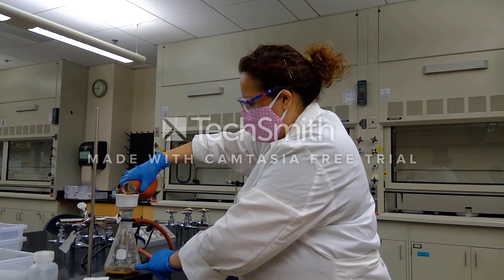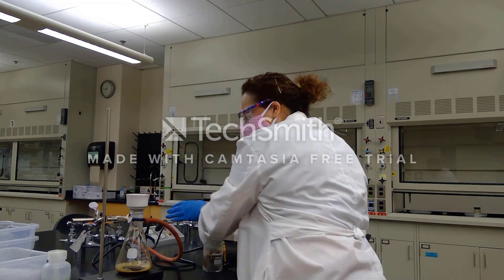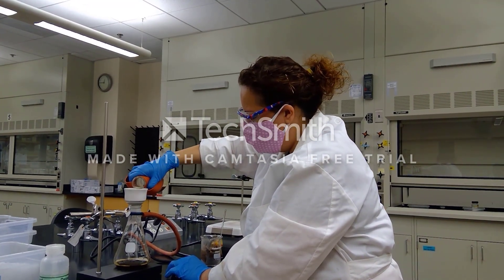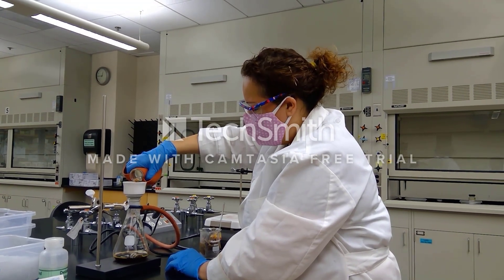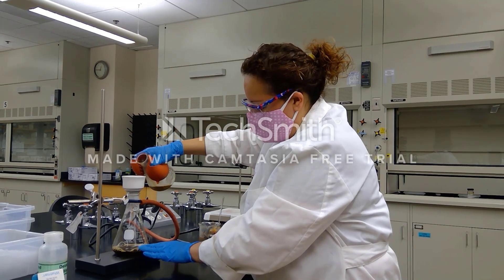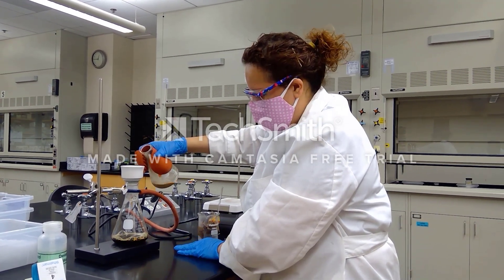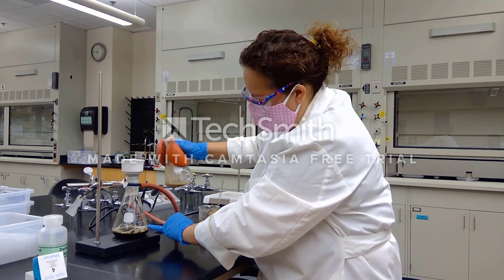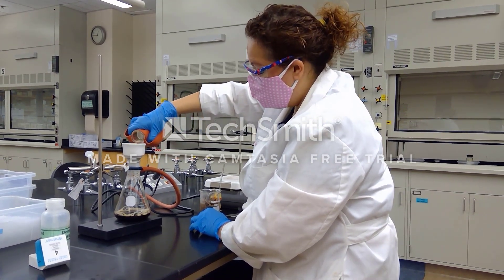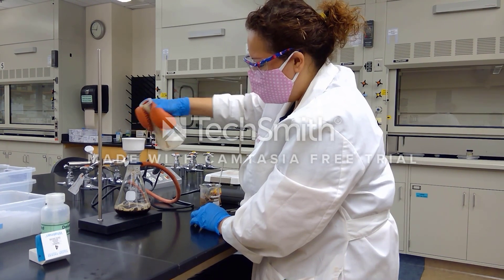As I'm filtering I'm checking my filtrate down below to ensure that we have a nice dark coloration going on. The reason why we want nice dark coloration down here is to ensure that no calcium carbonate has gotten through. If we get any calcium carbonate through it will ruin our next extraction process, which is the liquid-liquid extraction. The tea looks kind of like black coffee, and if you notice we're getting some foam — that's because tea has a whole lot of compounds known as saponins. Saponins are similar to soap molecules in that they have a polar side and a very long non-polar portion to the molecule.